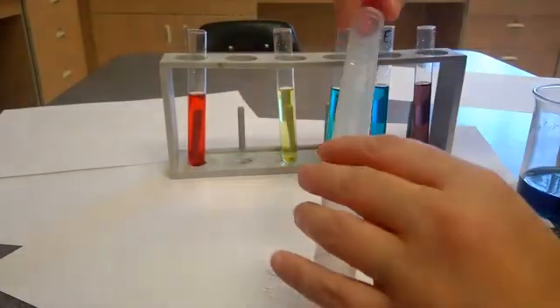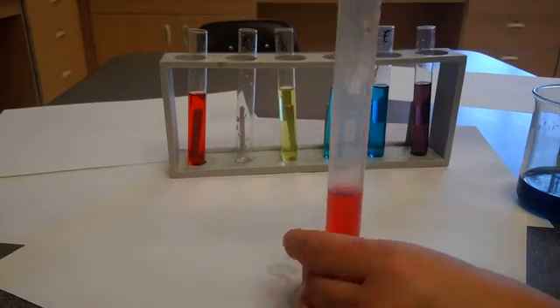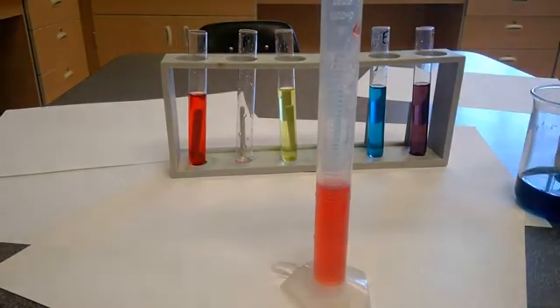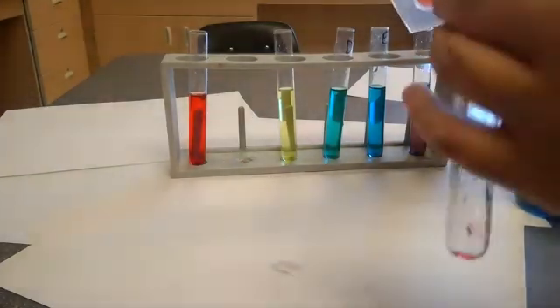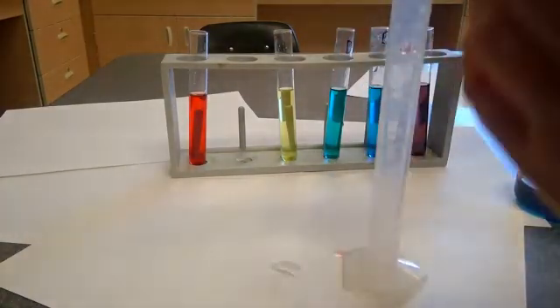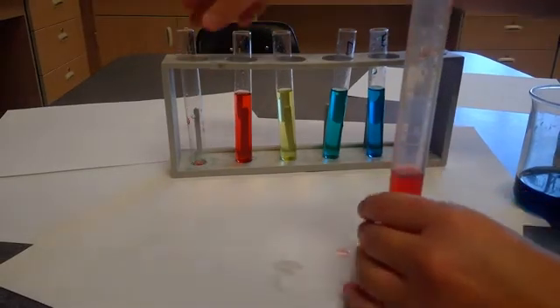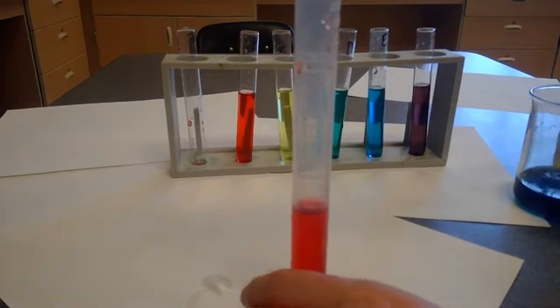Orange, moving on to orange. See if you can read that, a little tough. So on that orange, I can see there's the 10, 10 and a half, 11. Looks like that meniscus line lines up exactly with 11. Remember that meniscus line is curved, so that curve shows you the exact reading. And finally, I've moved on to my red. And the reading on our red is also 11 milliliters.